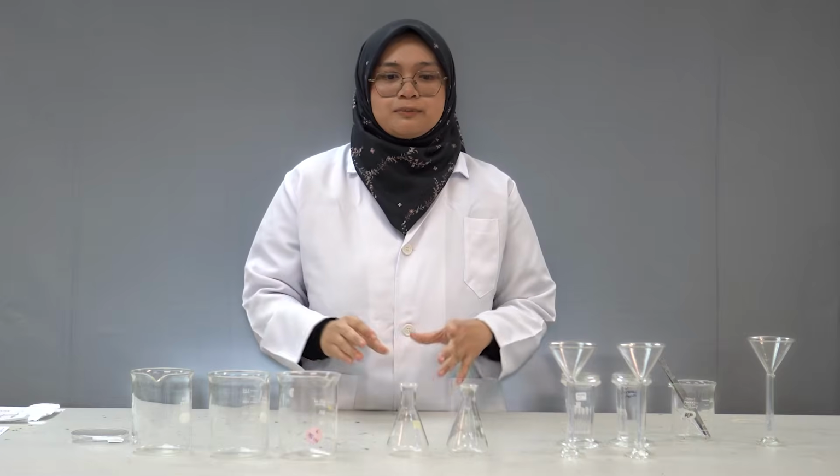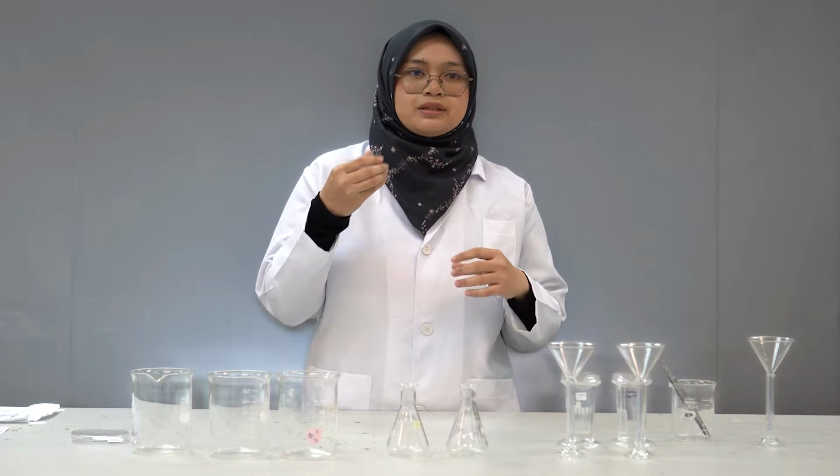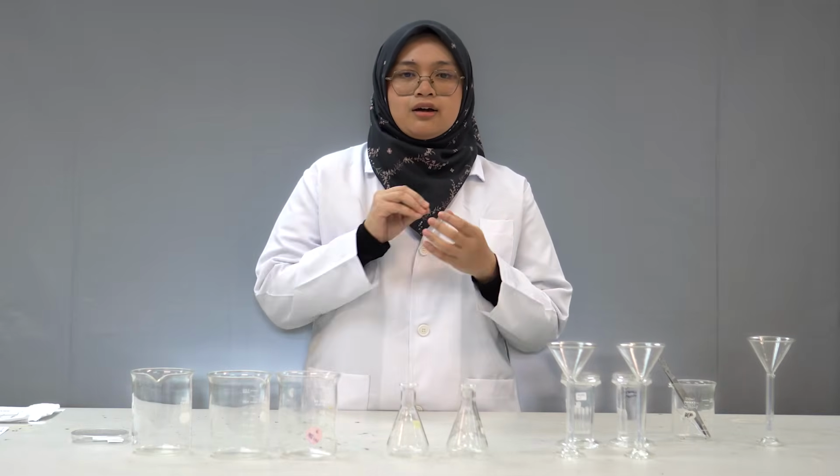After we plot the sample on the TLC plate, we have to see the TLC under the UV light.